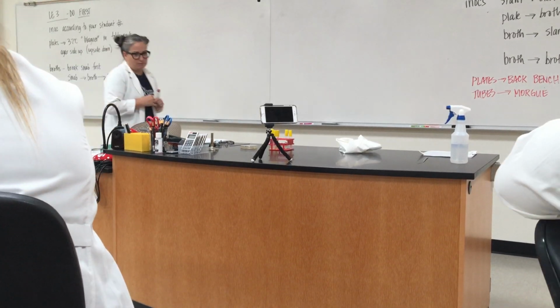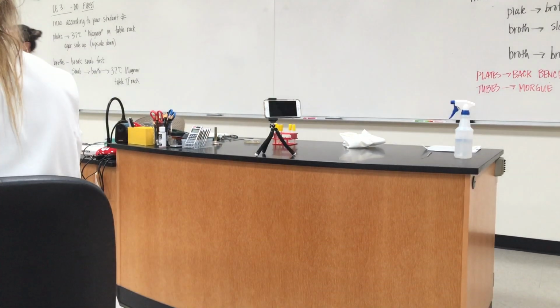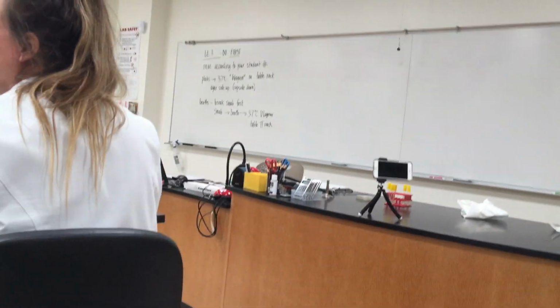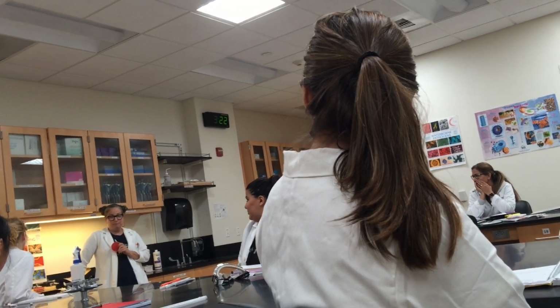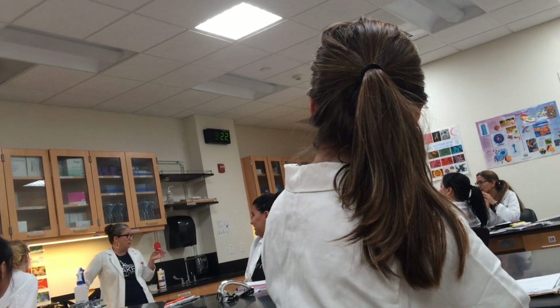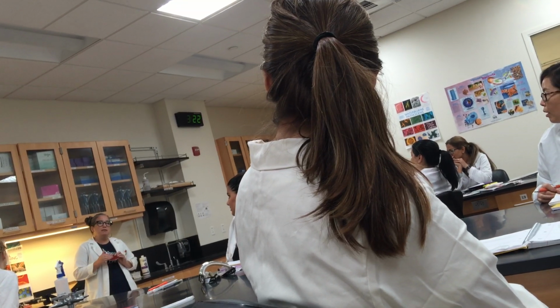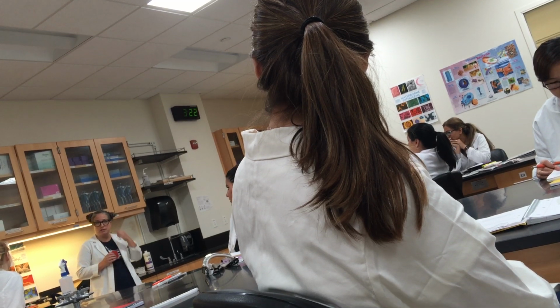And then we have vigorous cough onto blood agar. So only a few of you are going to be using blood agar. Guess how you can tell the difference between TSA and blood agar? It's red. We have to bleed sheep to make this. So don't use it if you have not been told to use blood agar. I mean, we don't personally bleed sheep, but that's how we get blood agar, right? Which is a really important medium because it allows us to tell whether bacteria are able to eat red blood cells, which is an important pathological consideration.